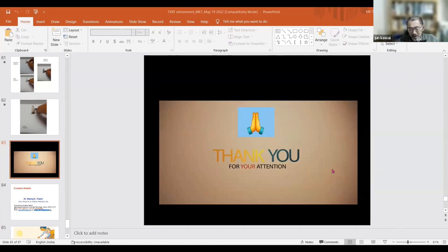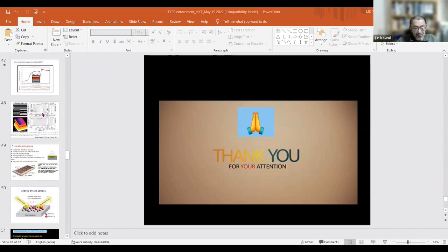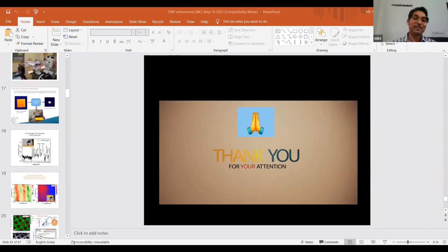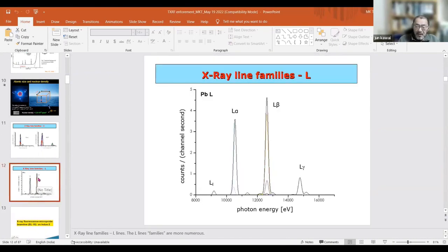You have shown us a very interesting spectrum in the early stage of your talk. It was Pb L alpha and L beta, just after the silver K alpha one. Yes, the next one. Yes, it's Pb L alpha and L beta.